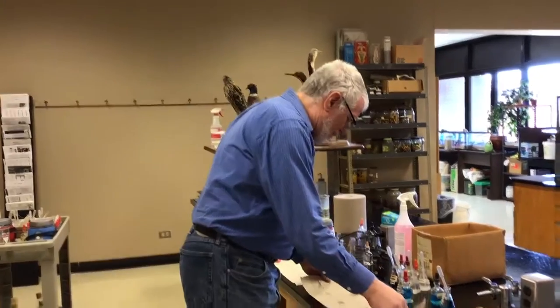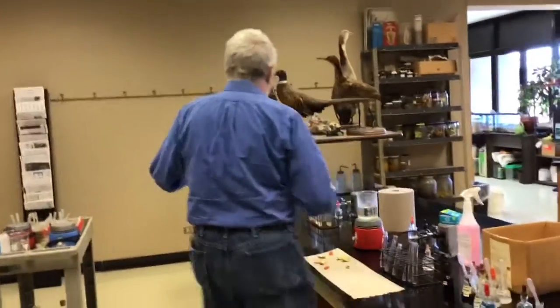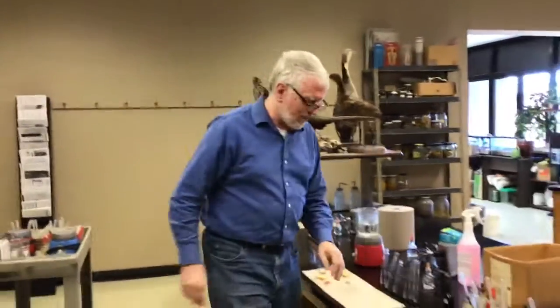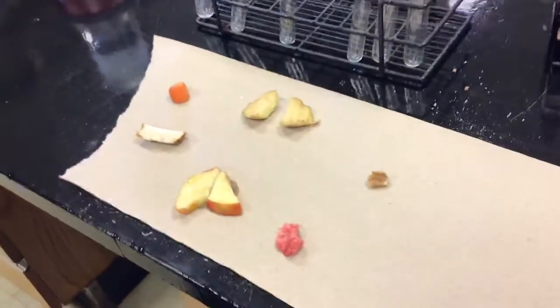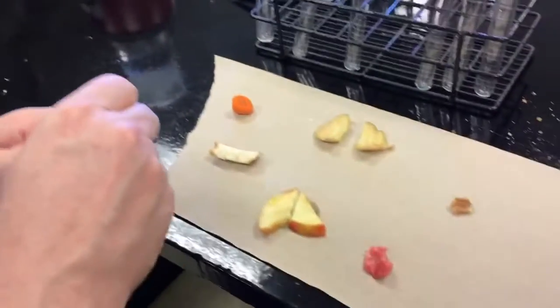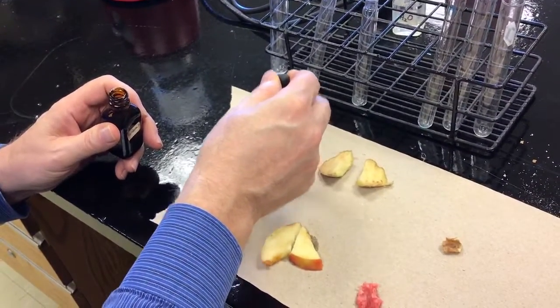So I'm going to take this paper, and like we did with the first set, I'm going to kind of shake some of the residue off. Set it aside and let it dry. Some of the drops will dry completely and some of them won't. So now we come over here, we're gonna run the Lugol's test on the pieces. So I'm gonna put drops of Lugol's directly on the foods and see if we get a change to black. This only takes one drop. So, drop of Lugol's on the carrots.